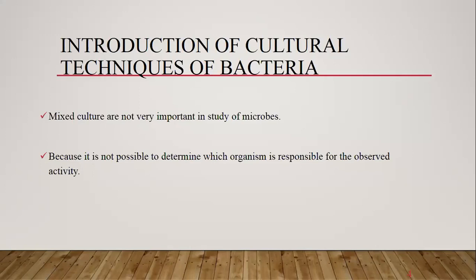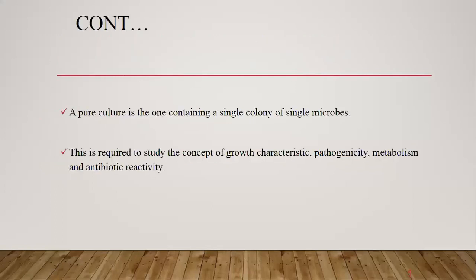This mixed culture is not very useful in the study of microbes, because it is not possible to determine which organism is responsible for the observed activity. So to study this activity, it is necessary to separate this mixed culture of organisms. For that purpose, we use a pure culture.